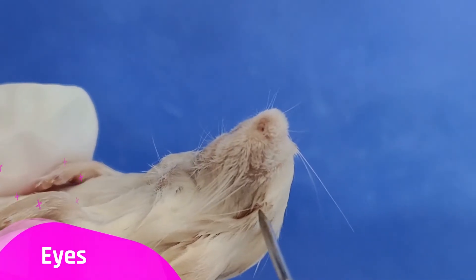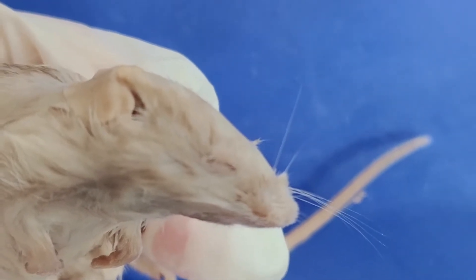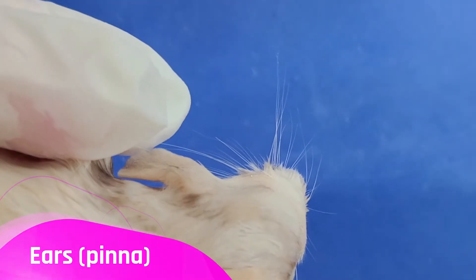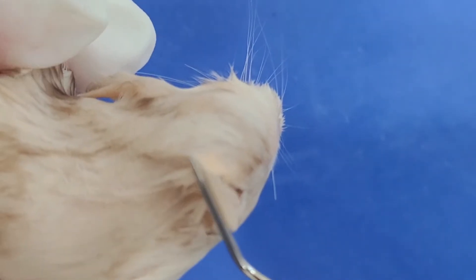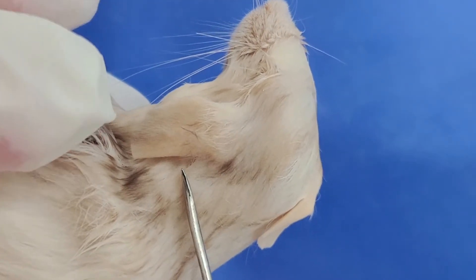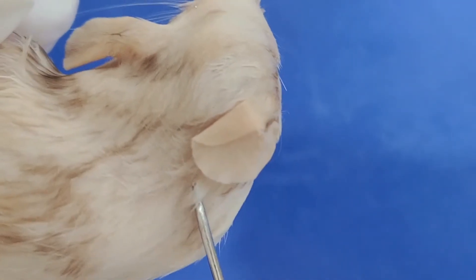Here are the eyes, one on each side. We can also see the ears, one here and another one on this side. The external part of the ear, which we can see here, is called the pinna.